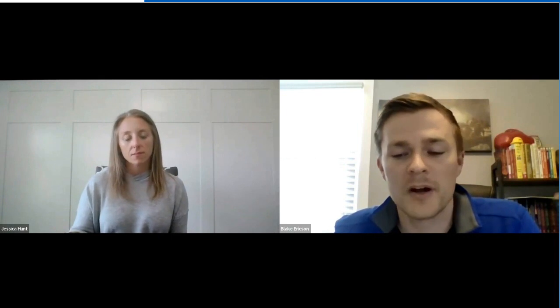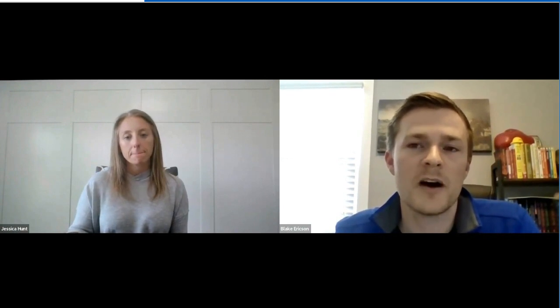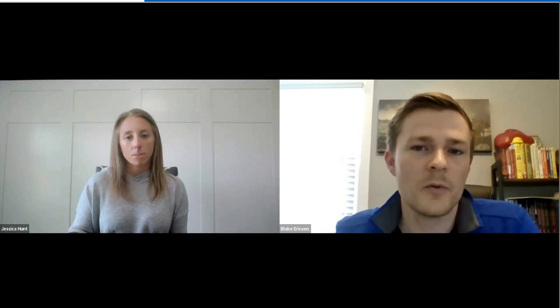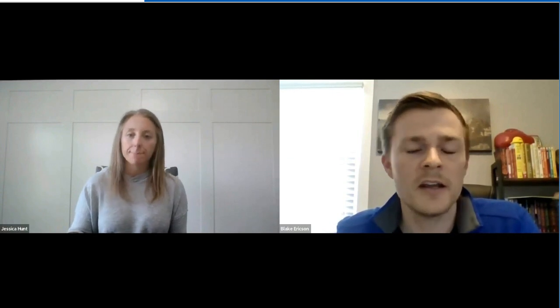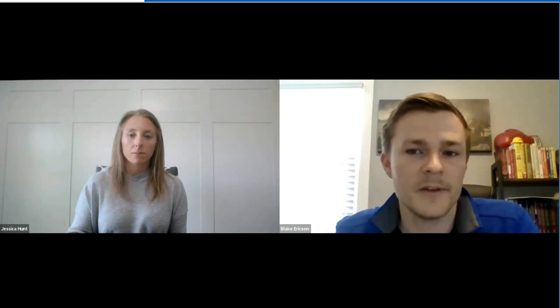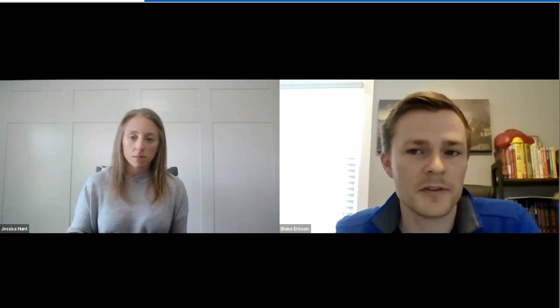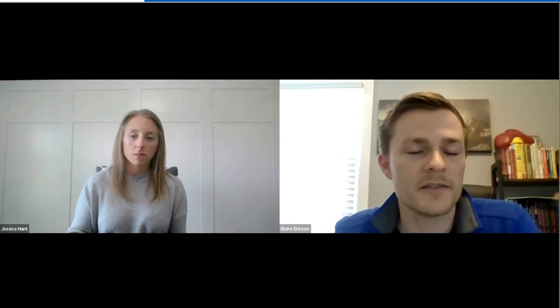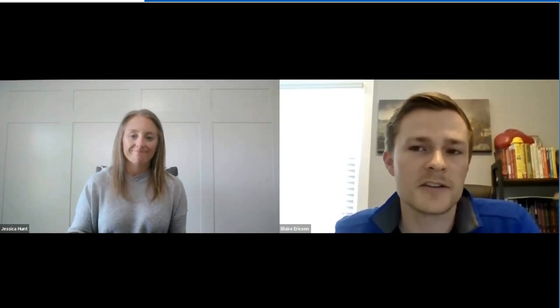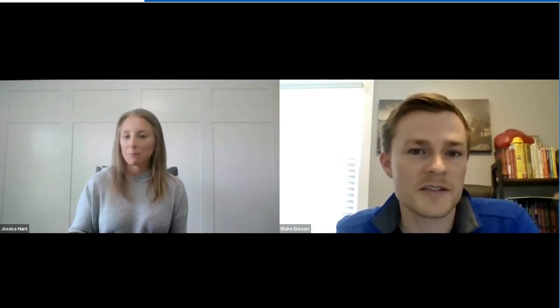But in terms of FTIR testing, we are kind of capped. What I've mentioned too is you want to match your sampling temperature with your recipes and your calibration data. So let's just pretend you're running a 375 degree Fahrenheit analysis. You should be sampling at the same temperature, just a general rule of thumb. Absolute upper limit is usually right around 400 degrees if you have to go up that high. And that's just because we get to the melting point of Teflon. And of course, you don't want to melt your sampling systems because that's pretty expensive.